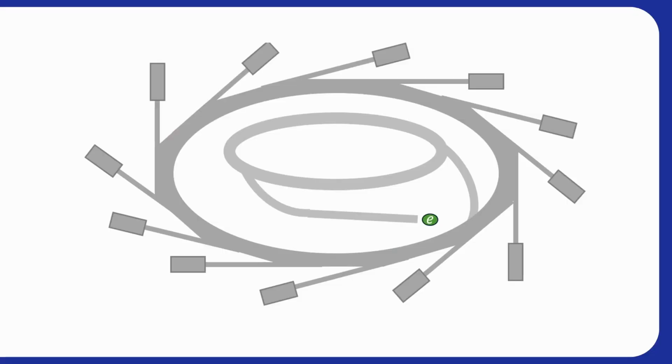At ALS, electrons are generated and accelerated in a linear accelerator. They are then bent with magnets and directed into a circle and further accelerated to 99.999% of the speed of light. They are stored in a bigger outer ring where they can be manipulated to generate all kinds of particles, including X-rays. The X-rays are directed out of the storage ring through beam lines to experimental end stations where scientists can conduct research. For example, X-ray crystallography of biological samples.